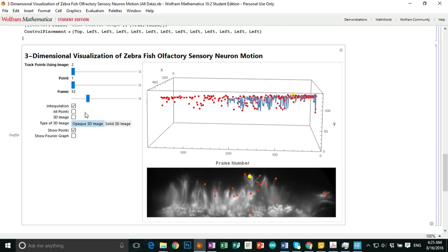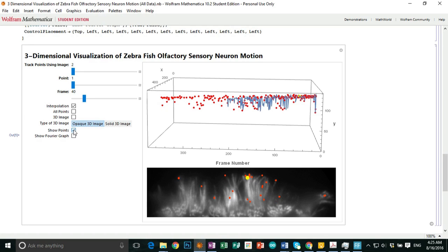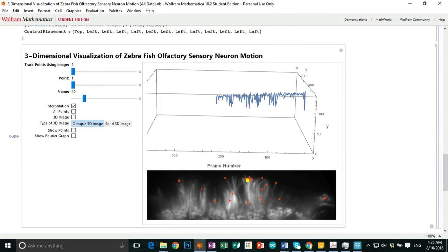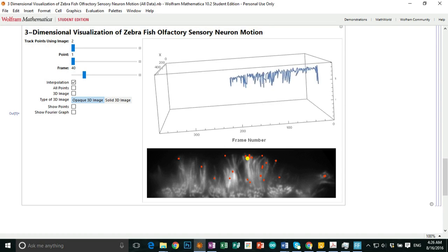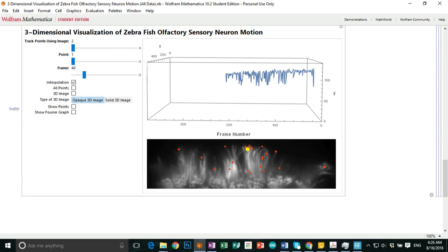And you can see the yellow dot here again. It's the same thing, so it will track all the way. And also, if you don't want the red dots in your way, you can hide them. Sometimes the interpolation does stop in the middle because the data does get too chaotic. But one other benefit of this method is that a majority of the points that it found actually tracked all the way to the last frame. So that's really great, because I remember having a lot of problems with not finding any points or having the interpolation stop only a quarter of the way, but the majority of these did actually go all the way.